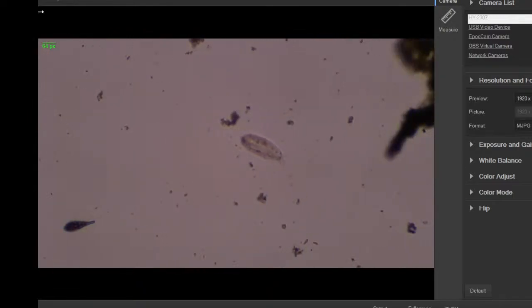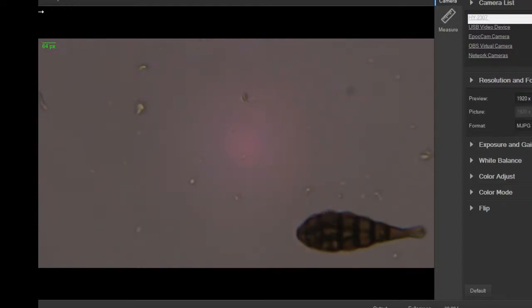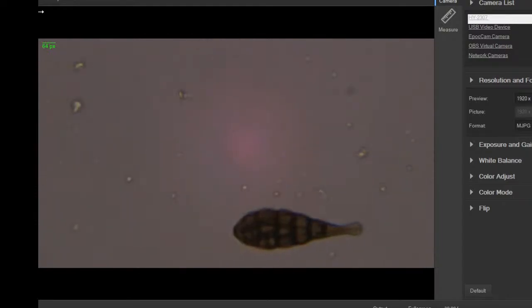Okay. Just for, ooh, another thing went cruising by there. I will try real quick. Can it take closer? Maybe a little bit closer. Just for fun. Oh, that's interesting. Wonder what that is.